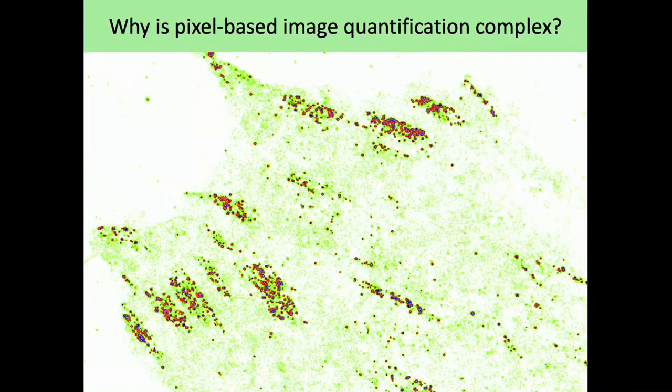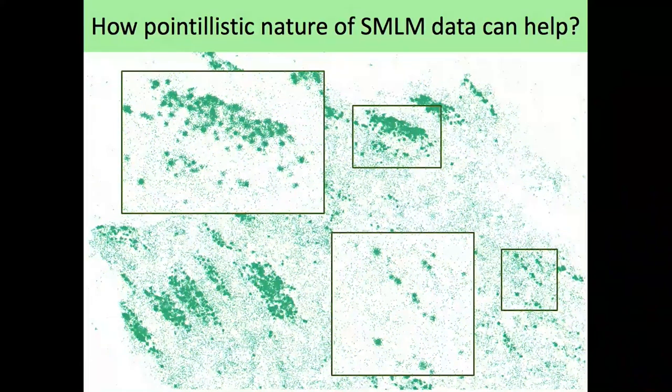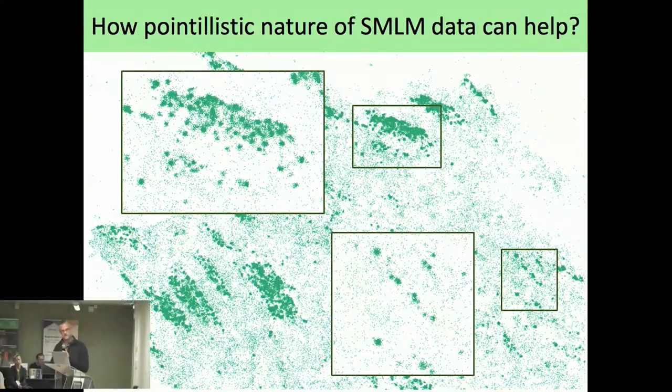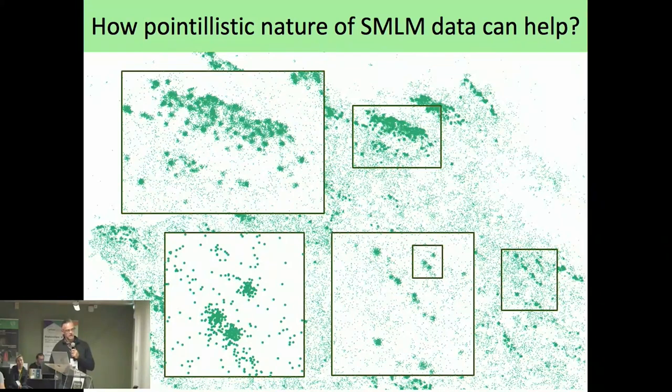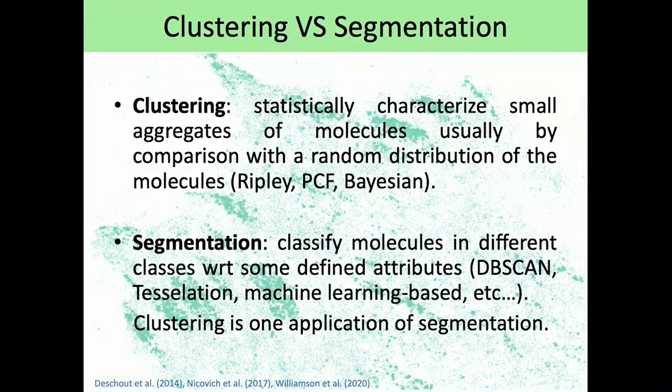So why start with this image initially? Okay, no, there was another thing I wanted to say. So now we have the coordinates. So the question that we and other groups raised was: can we already take information and quantify information directly from the coordinates and not from the image? This here.